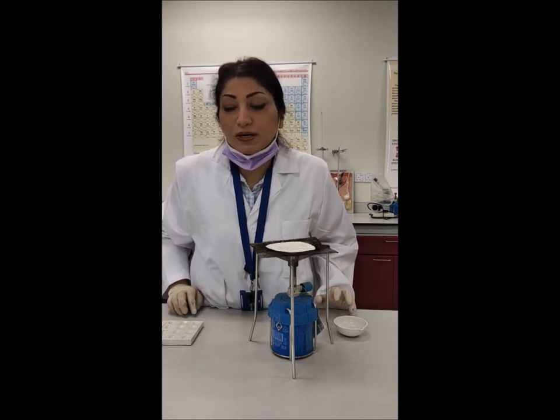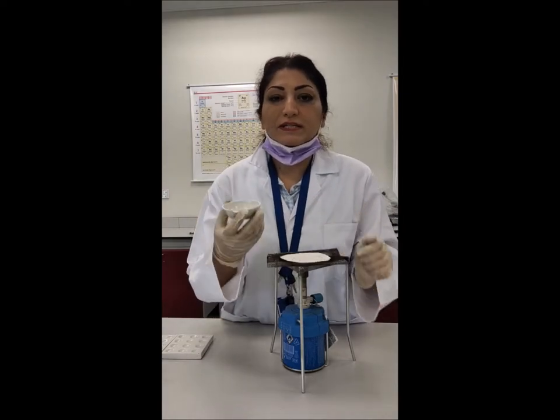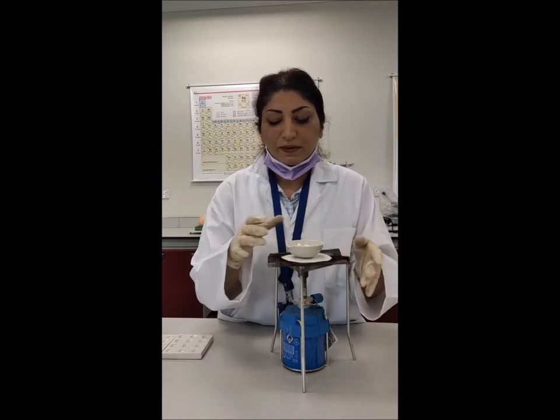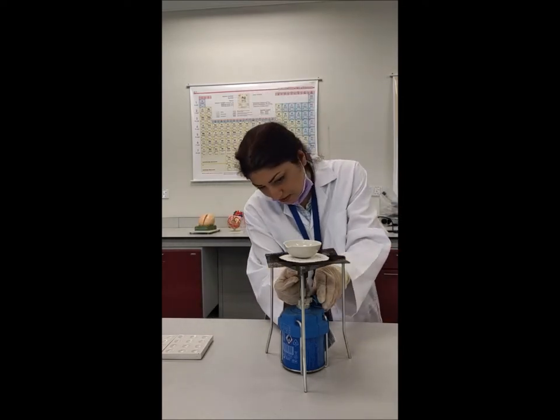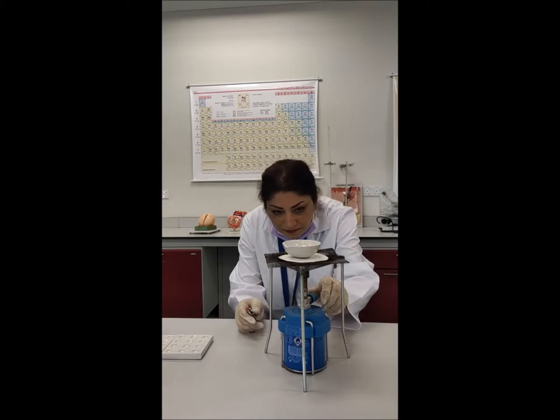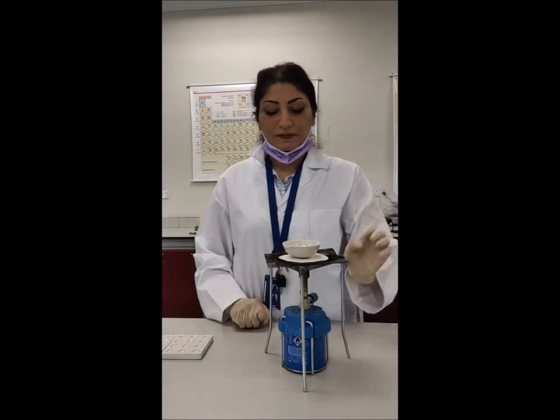What I have here is solid paraffin, and then orex. I put it on the Bunsen burner flame and let it heat gently to melt it. I reduce the flame and let it turn into liquid paraffin so we can use it.